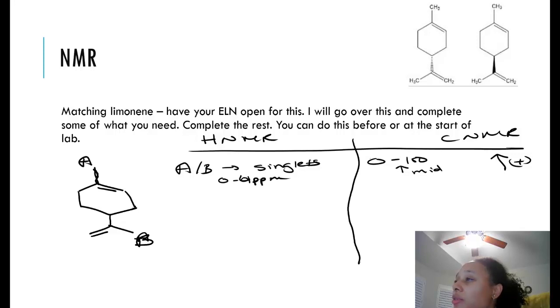I would say they're probably close to the 2, like 1.5 to 2 mark probably. And in terms of integration, when we integrate them, when we find them, we can set them to 3 hydrogens, because we know that they're supposed to be 3 hydrogens, right? So that's the thing with integration when we're using the software.